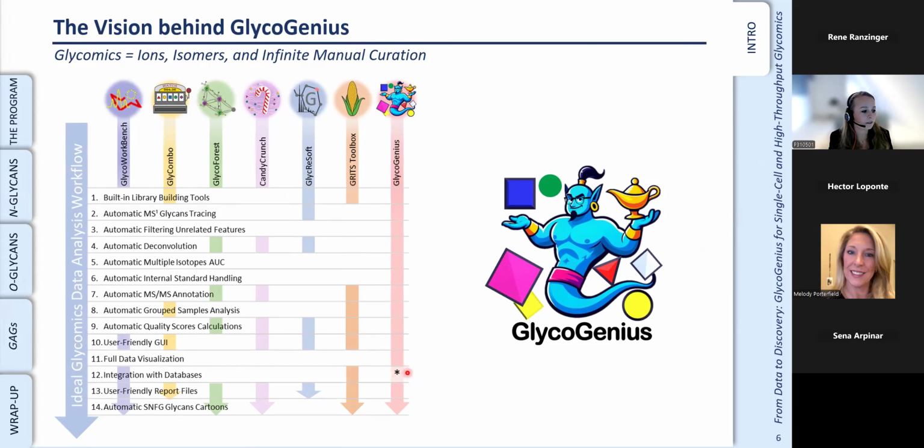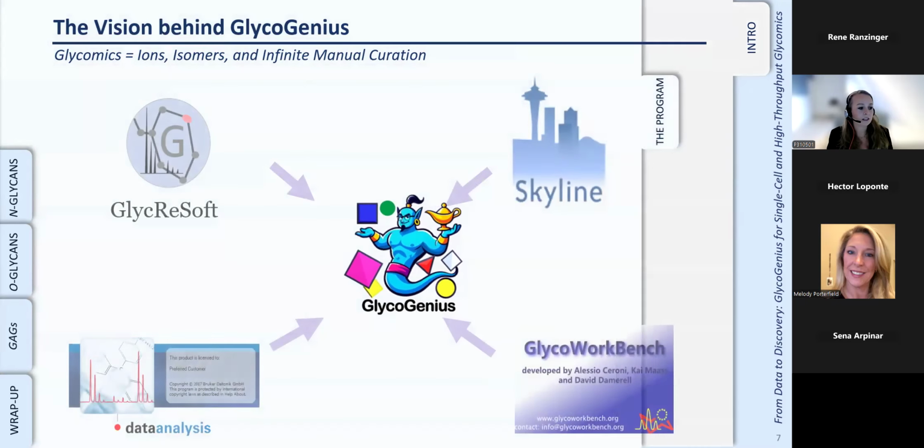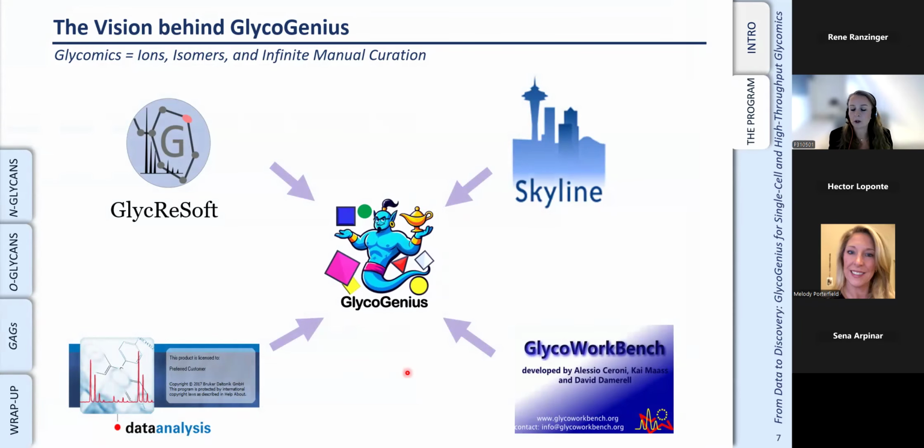So at the moment, the integration with the databases is not fully there yet, but it is an ambition that we're striving for. So GlycoGenius is not just built from out of nowhere. We actually took a little bit of the parts that we were looking for and that we really liked from the different software tools that are out there.